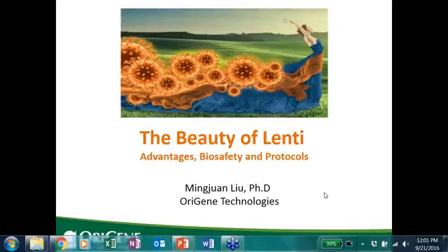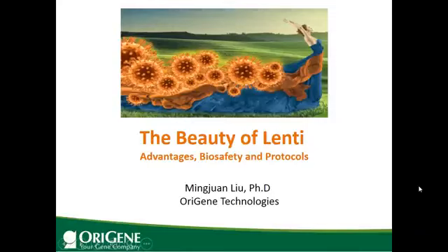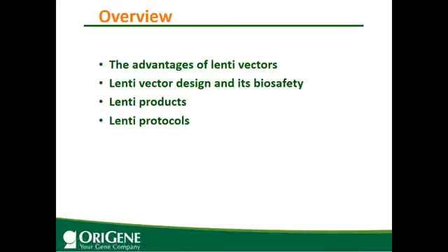Okay, so today we are going to talk about the beauty of Lenti. Why we want to use Lentivirus as a gene delivery tool, the advantages, biosafety, and protocols. So this is an overview.